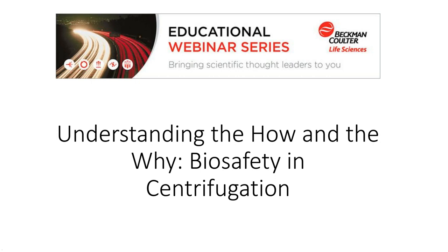An OQ for a centrifuge calibrates speed, time, and temperature. And it really is something that does not need to be done very often. My suggestion would be maybe 6 months, possibly a year, again, depending on corporate requirements. But that's something to discuss internally as to how often that needs to be done. The only time I would say an OQ needs to be redone is when that centrifuge is moved.